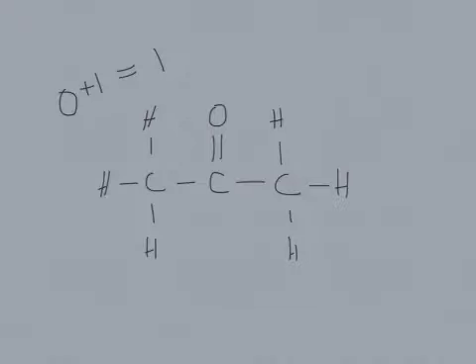We know we only saw one peak, and that helps us to determine that we do have, in fact, the correct structure. If there was a hydrogen bonded onto this, I will put that in there. For some reason, if there was a hydrogen on here, we would be actually at 1 plus 1 for this hydrogen, because it's bonded to this carbon.